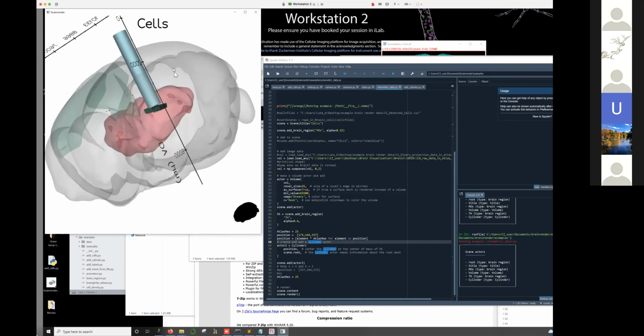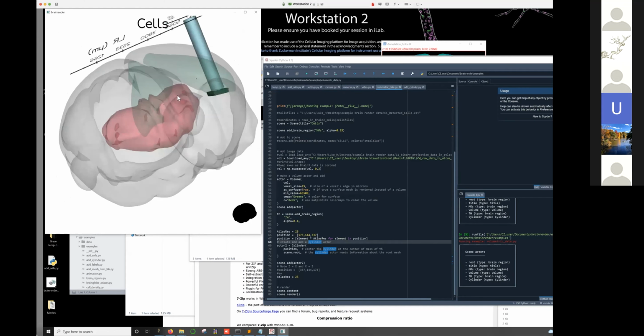And one final thing that we could add to this, so you could use this again with all the animation and orientation views to get some nice screenshots of this.